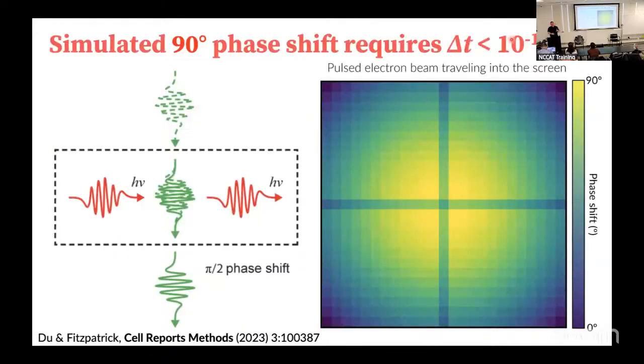And so this is really the basic premise of our experiment, is that you're going to have electron packet coming in. So you see this Gaussian shape that they have. So all the electron packets and the photon packets are kind of Gaussian shaped. So you want to have that coming in. Then somewhere in the microscope, probably the back focal plane, but you can also put it in the projection chamber, anywhere that it's coming to a point and then going off again.